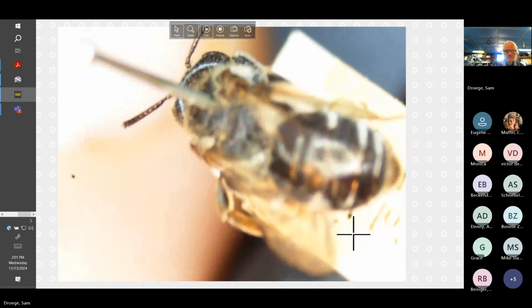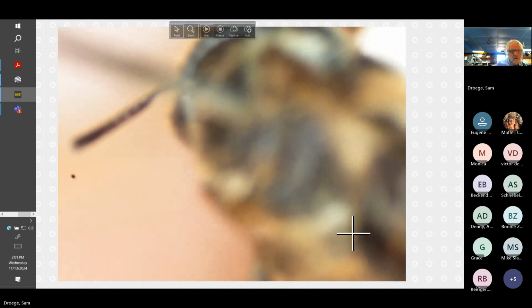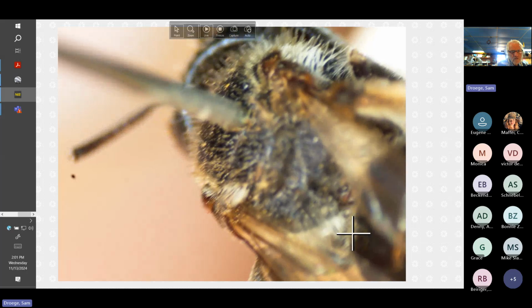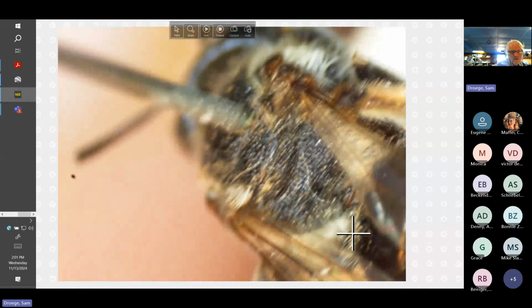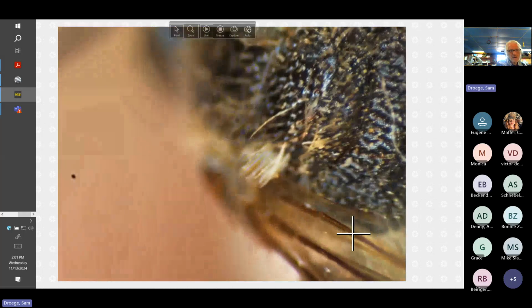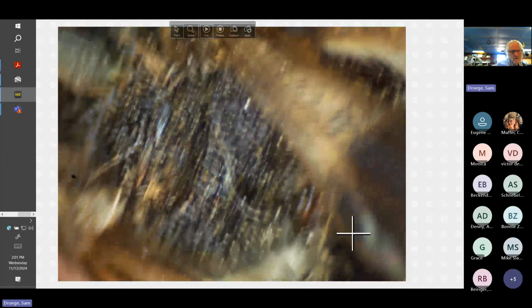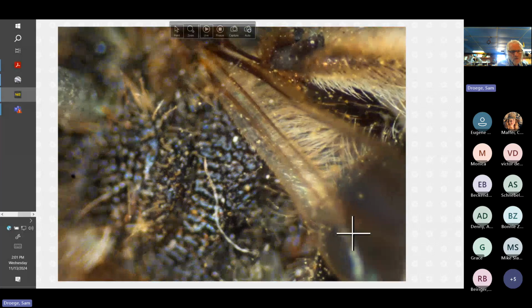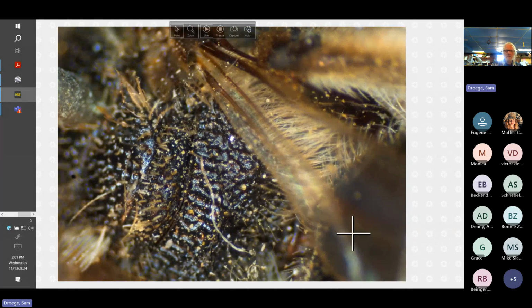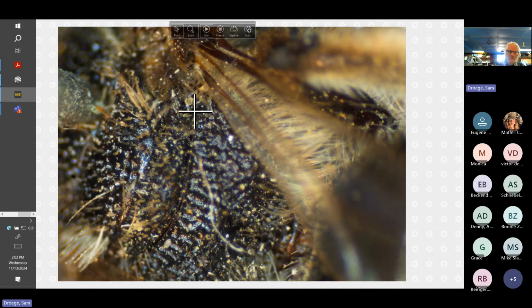Okay, so theoretically, it's going to be very difficult to differentiate the triangle area from the non-triangle area, and there's no real raised line per se on that boundary. On the inside, a little bit coarser, but not a whole lot. And so you can almost always draw this line from this corner down as the triangle.